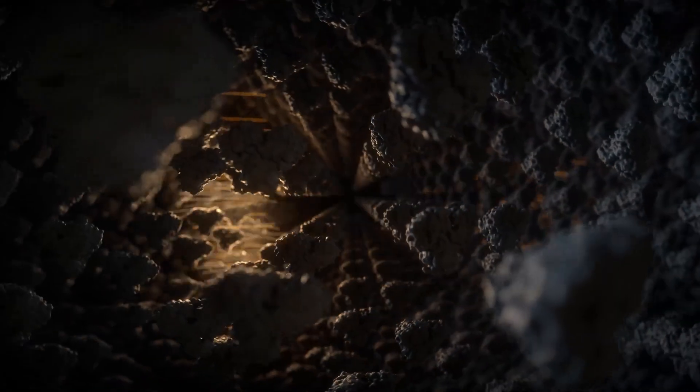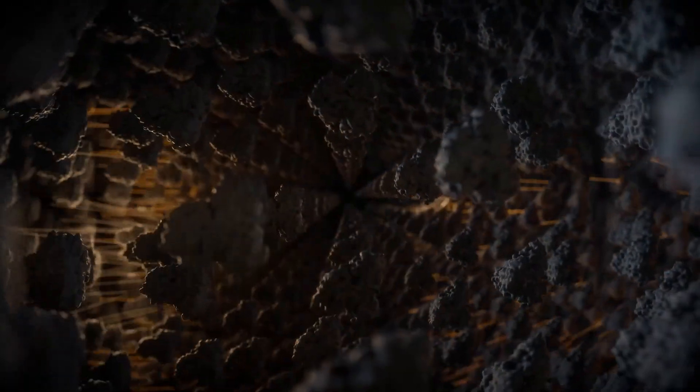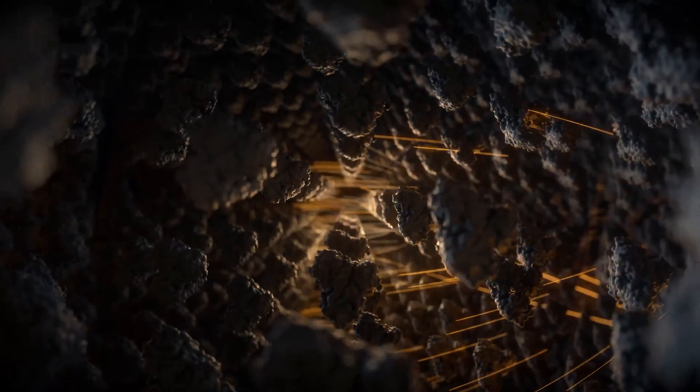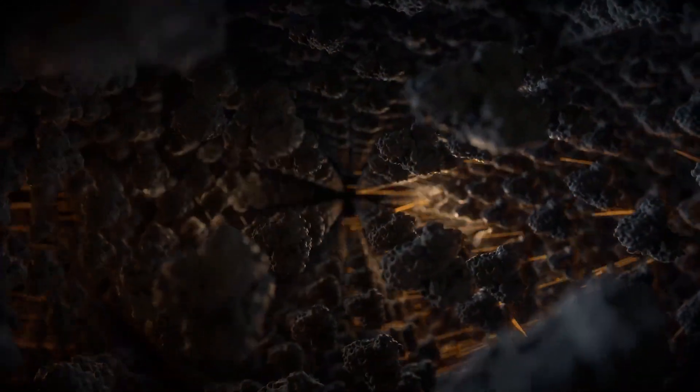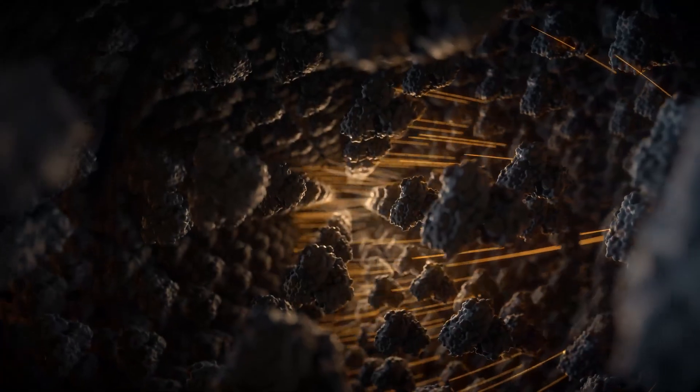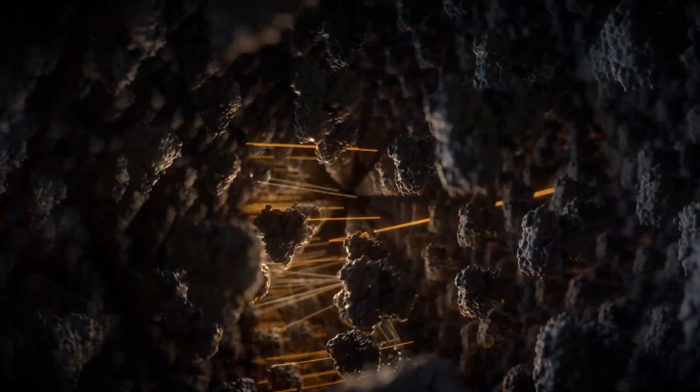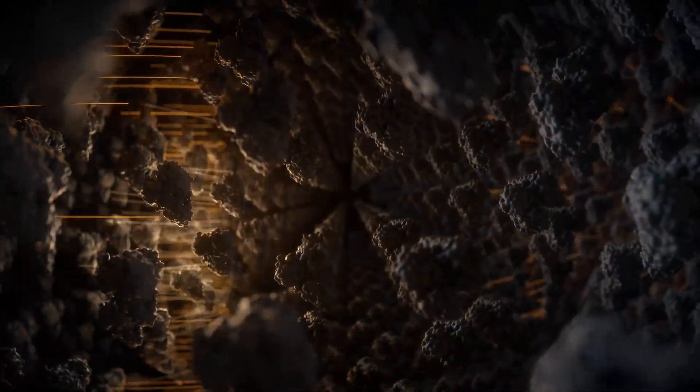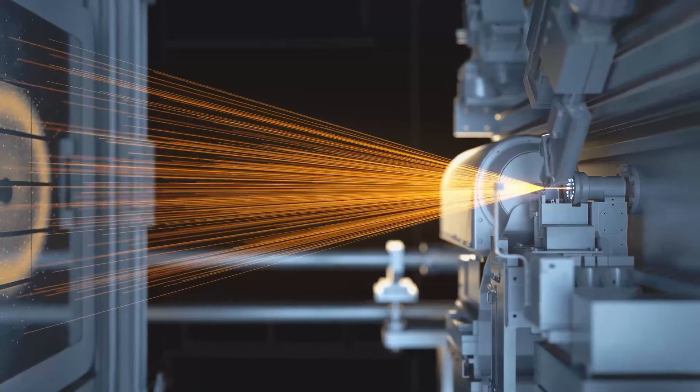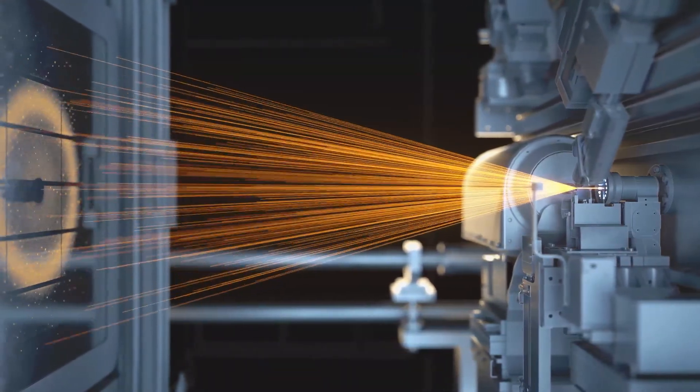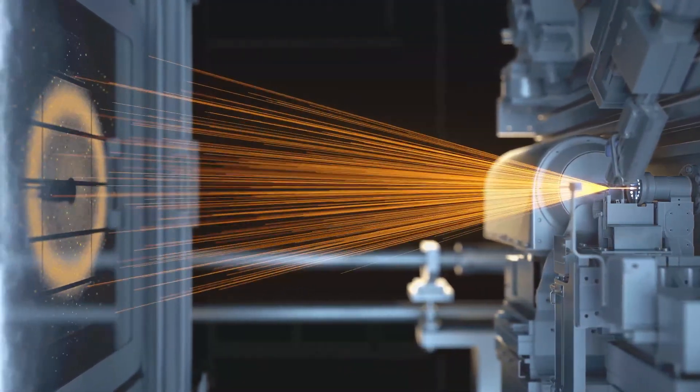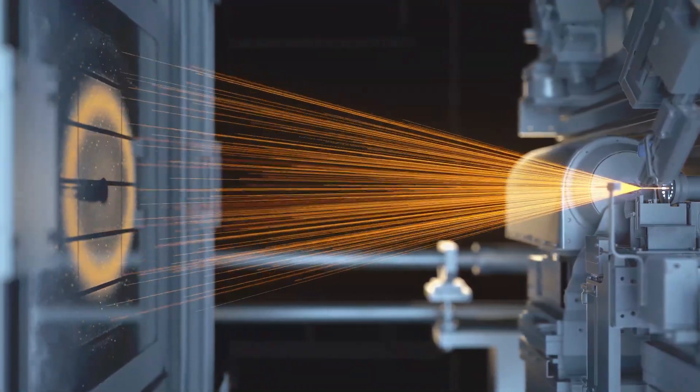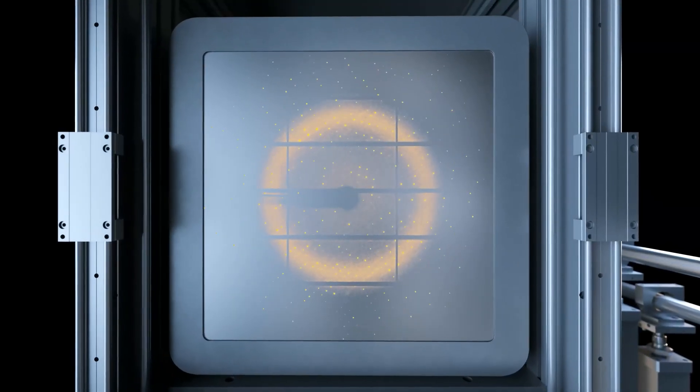x-rays. During the measurement, the crystal is turned and illuminated from all sides with the x-rays. The crystal comprises a repeating structure of many individual molecules of the target protein. These building blocks of the crystal could also be a mixture of the protein and a possible drug candidate. The x-rays are bent by the repeating structure within the crystal, forming a characteristic pattern of light that is captured by a detector.